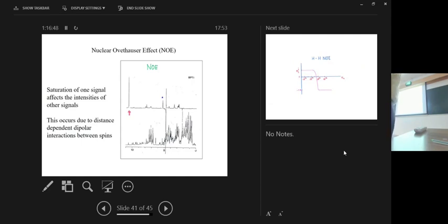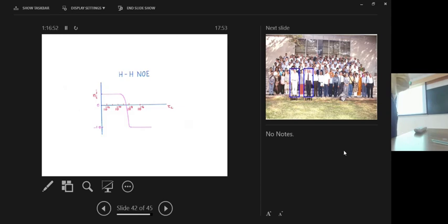And therefore NOE has become an extremely important concept in NMR. You see the kind of NOE enhancements you will get will vary from proton to proton and from molecule to molecule, and that depends upon the molecular motions inside the solution. Molecules are tumbling around, so depending upon the rate at which they are tumbling, you will have different kinds of NOEs, for small molecules and big molecules. What are these? The correlation time, tau c.